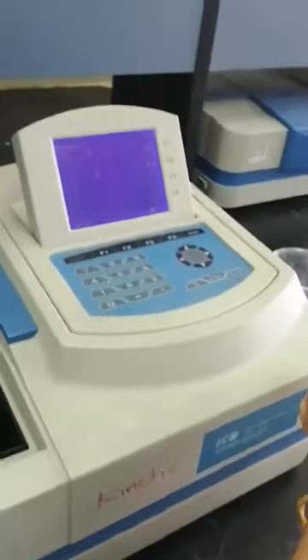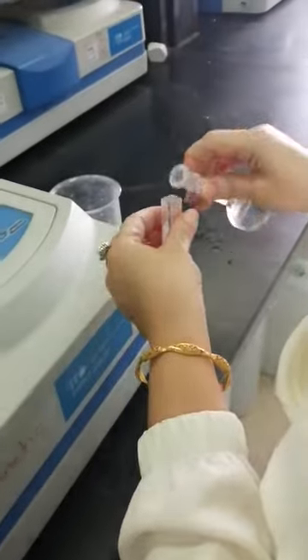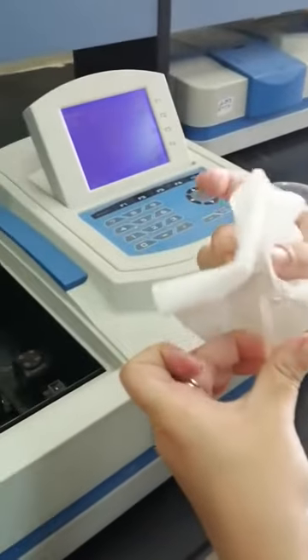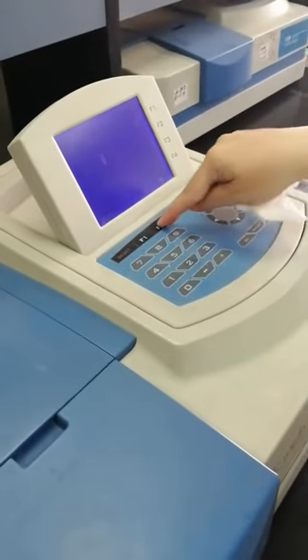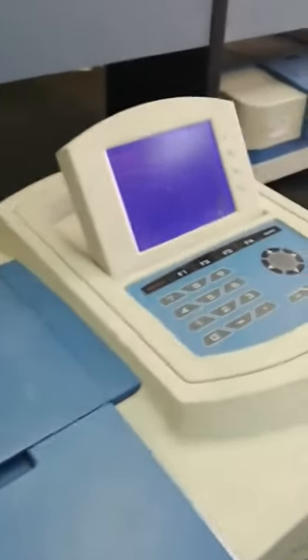I will add the sample, and UV is adjusted using the phosphate buffer as a blank. I will add my sample and measure the absorbance value.